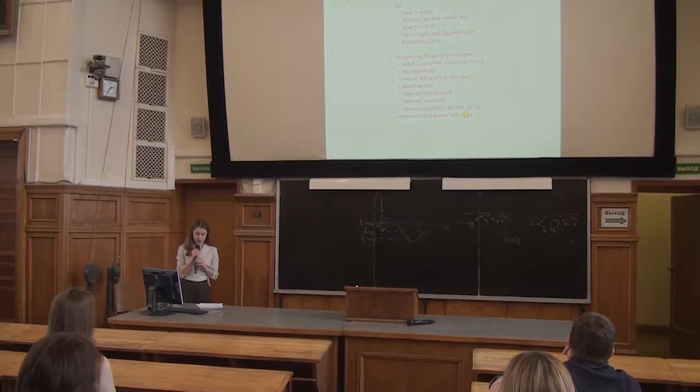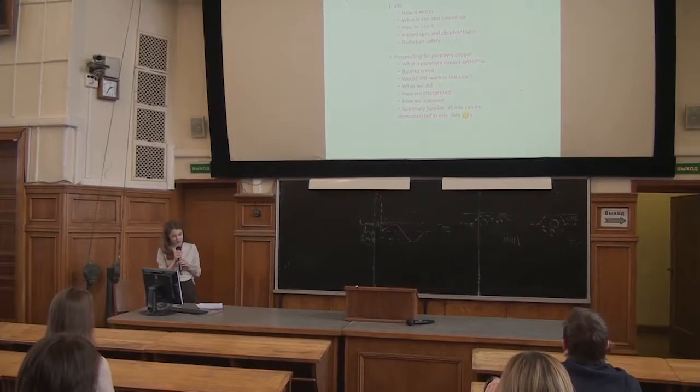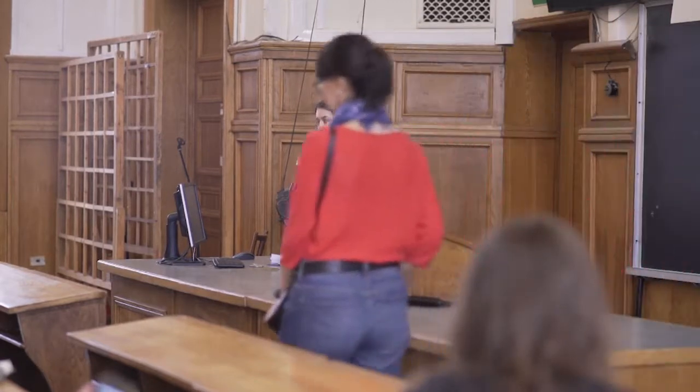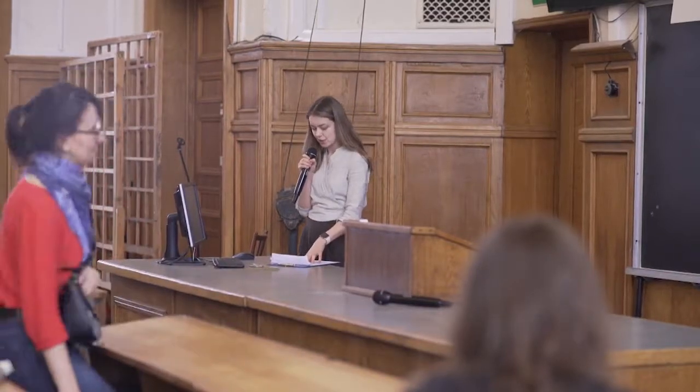I'm going to speak about how it actually works, what it can and cannot do, different operation modes, its advantages and disadvantages, and since its radiation is ionizing, I must refer to radiation safety when using such analyzers. The second section will address the technology of geochemical prospecting of porphyry copper. I'll show the commonly accepted model of a porphyry copper system by tool.